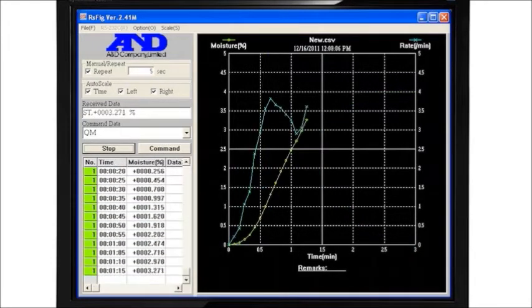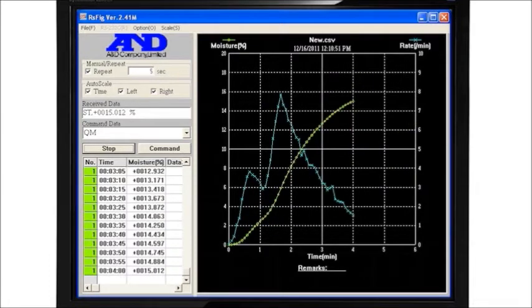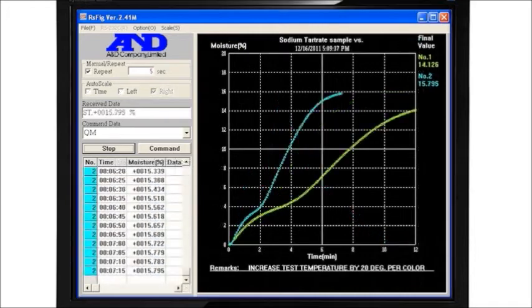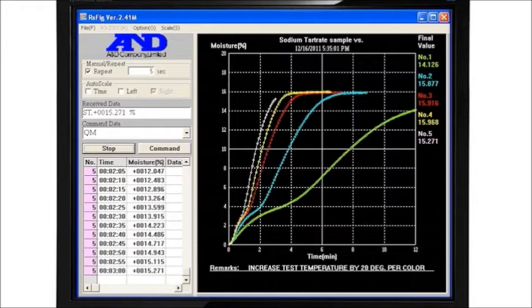Here, WinCT plots moisture content as it reaches its final value, and the change in moisture rate approaches zero, indicating the sample is now dry. Successive measurements at different temperatures are graphed in different colors.